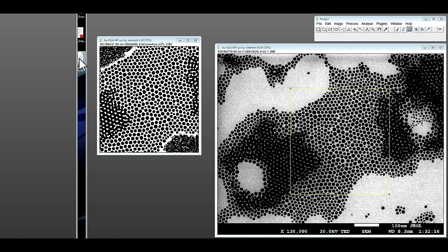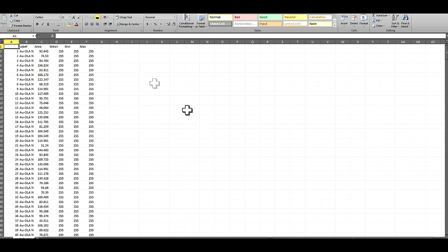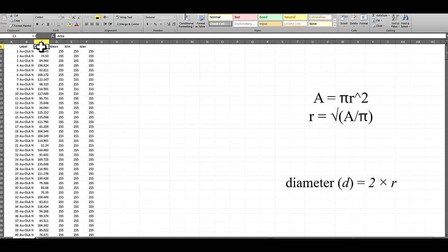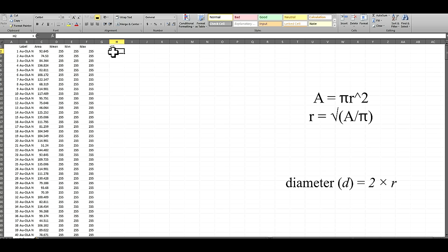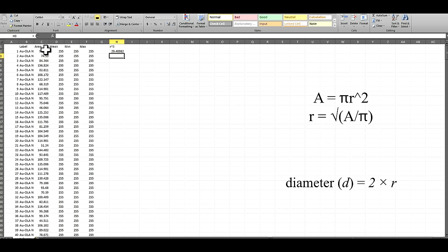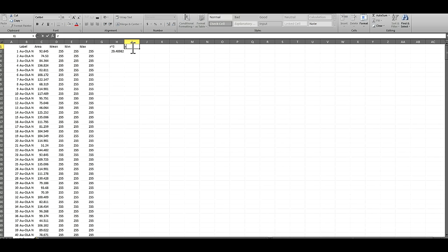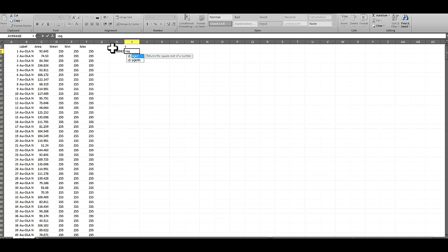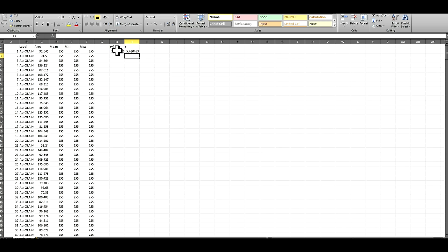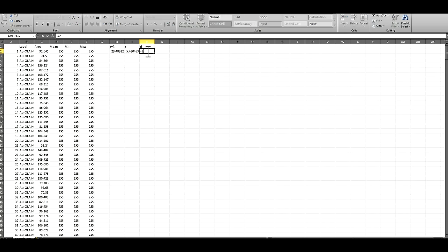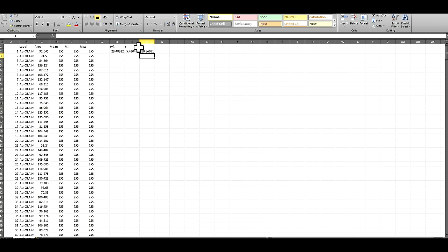Then you can open, here is area in nanometer square. So radius squared equals area divided by pi. Radius which is equal to square root of radius square, and diameter which equals 2 times radius. So diameter is in nanometer.